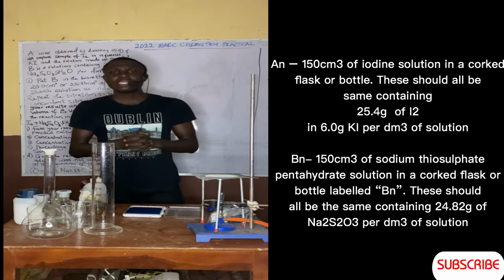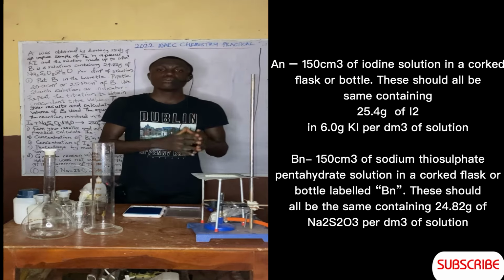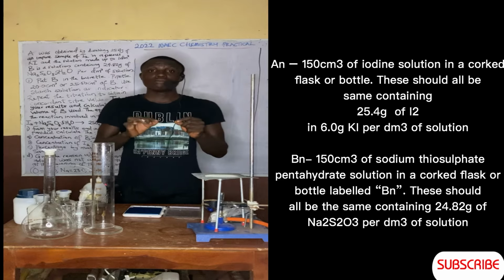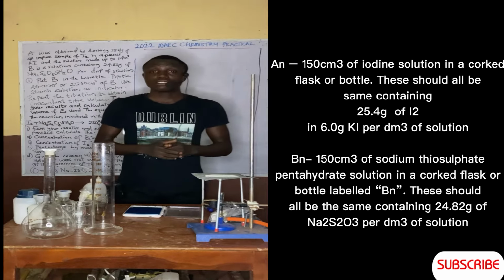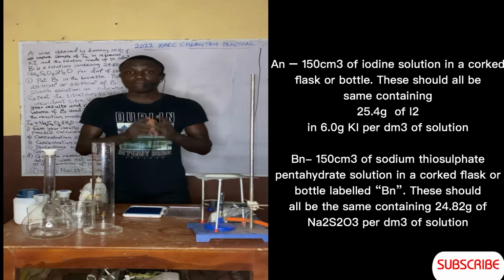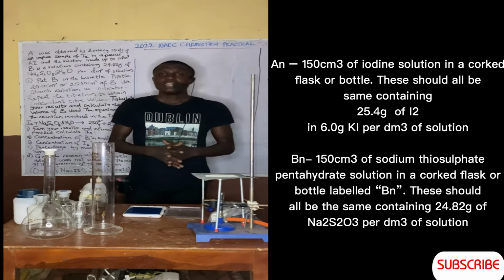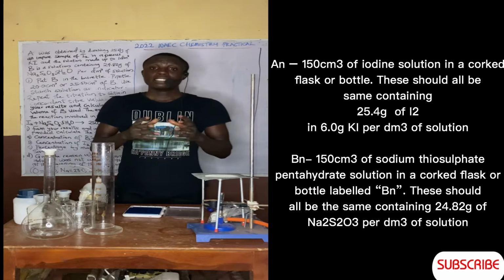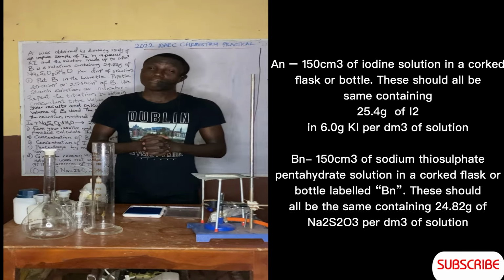Today we are going to be covering the 2022 chemistry practical. The first question involves the redox titration, specifically the iodimetric titration, and here are the materials needed to prepare the solution for the experiment.